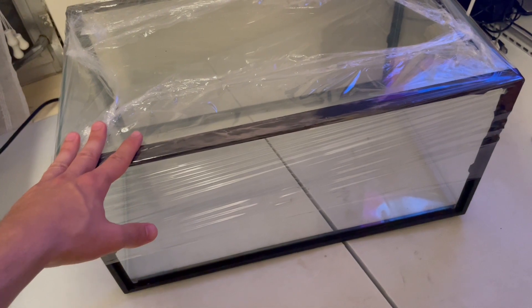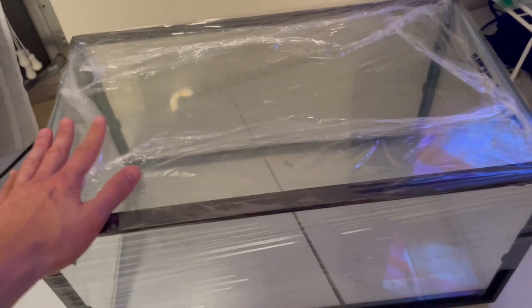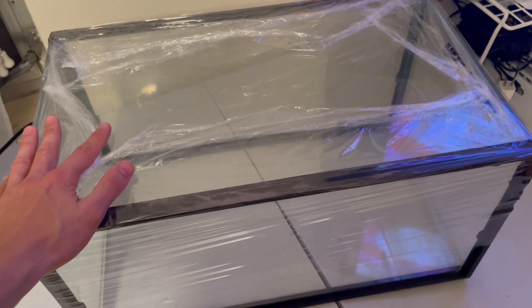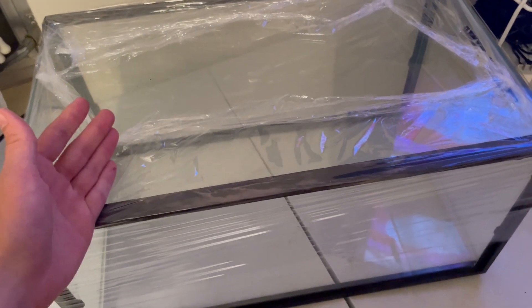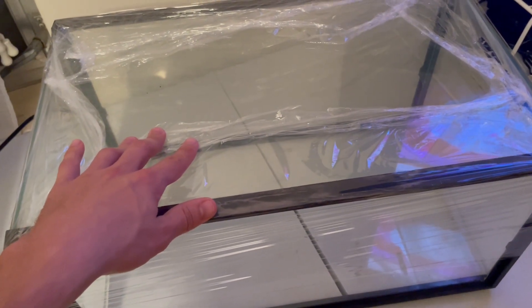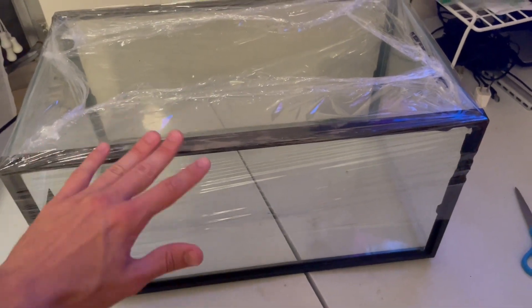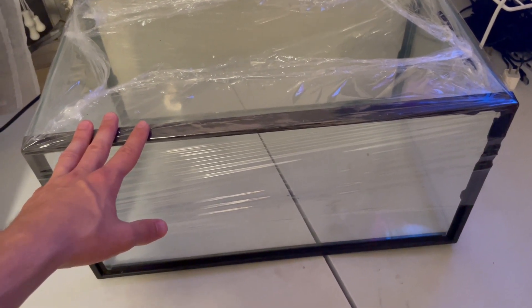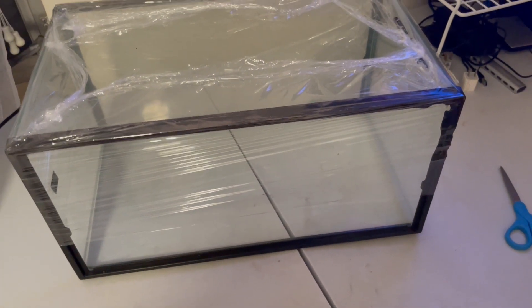If you decide one day you want to upgrade to a laminar flow hood or something, you can still utilize this for storing agar plates or taking spore prints. I find it's really useful for that — it keeps dirt from falling onto the aluminum foil and you can easily take it out when you're ready.